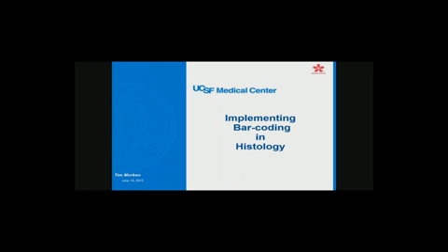I'm going to go through a few slides that reiterate the advantages of barcoding in the laboratory, but for the most part, we're going to talk about what the process is of actually doing that rather than all the benefits of it. One thing about this kind of process, any kind of software process, is every laboratory is going to be different. A small laboratory with half a dozen people is going to be a lot different than a large laboratory with 30 people. Resources will be different. The type of software you pick may be different. The path you take will be different. And there's really no set path. So I'm just showing you what you want to consider rather than giving you a definite roadmap.